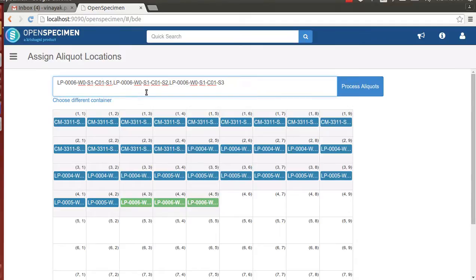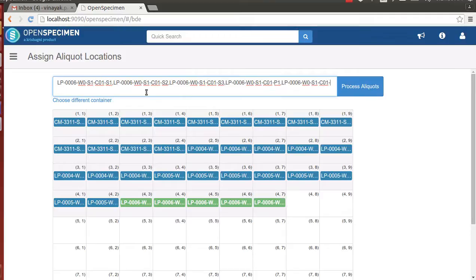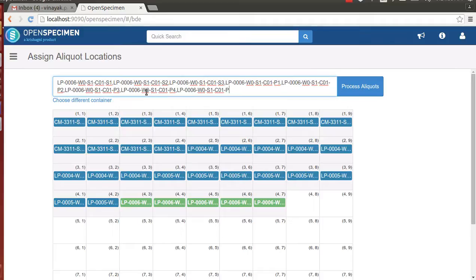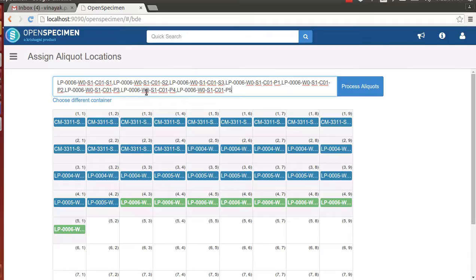We have 3 serum aliquots and 5 plasma aliquots. We will enter each one of them here. The positions that will be assigned to aliquots are all highlighted in green color. We inputted the aliquot labels of the first patient visit.